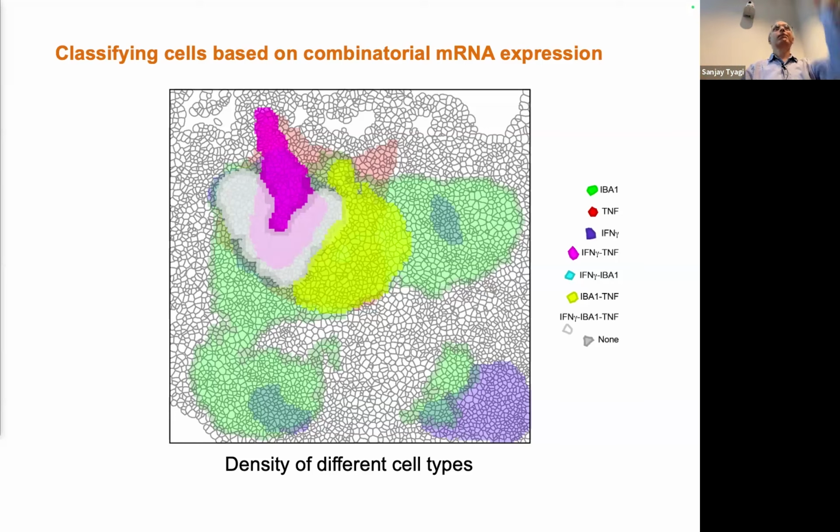How do you find the threshold to see if a particular cell is expressing a marker? Yeah, so you develop a histogram of all intensities for all cells, and then you can have a slider that says, okay, at this threshold, I consider it positive. And then obviously it's a little bit subjective.